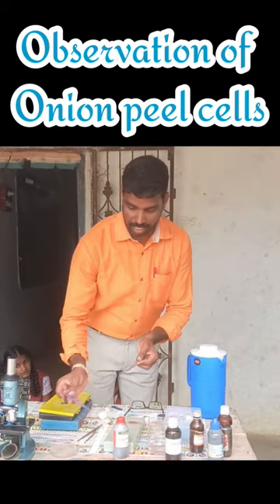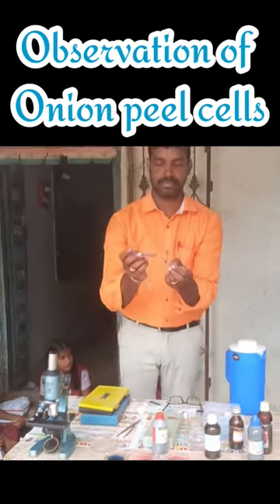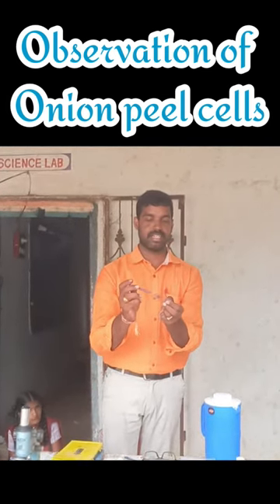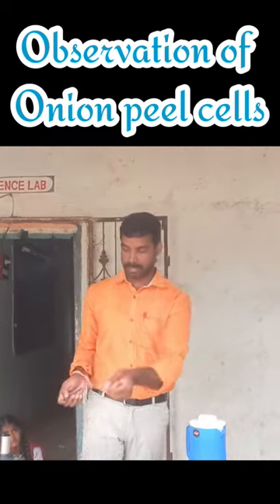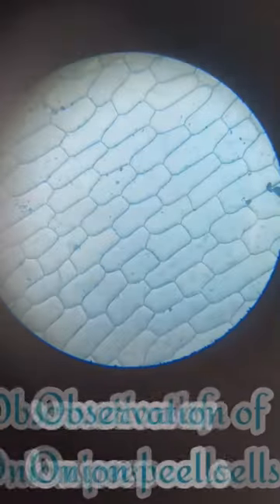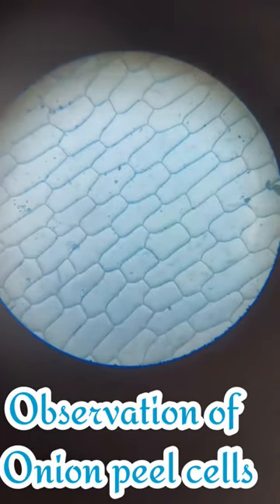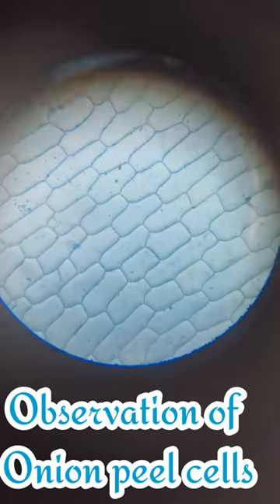Observe under the microscope. These are onion peel cells — they appear very clearly under the microscope.